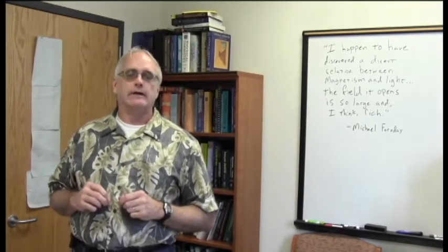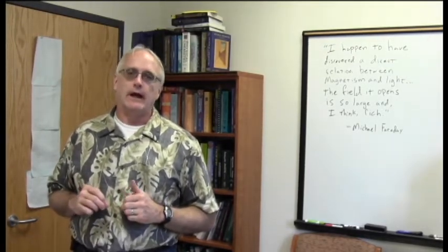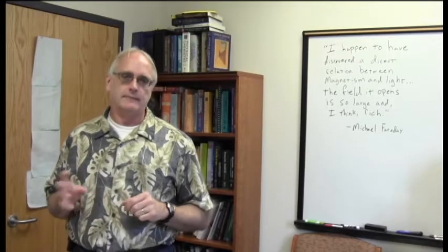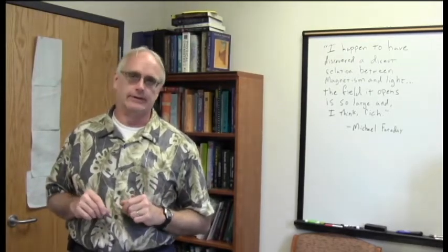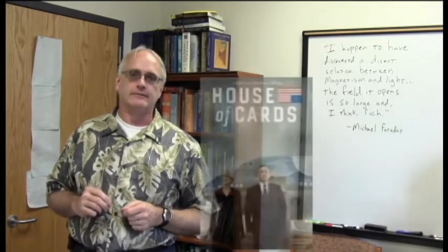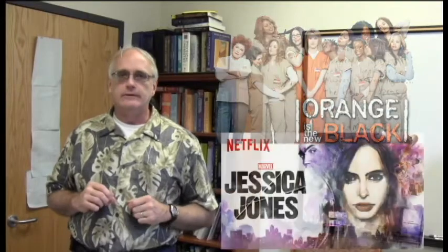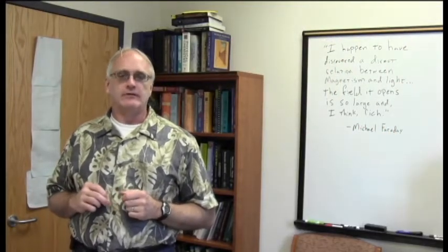Now, Dr. Hurst did not use NMR very often, so he asked me to help him with it. And, naturally, I hemmed and hawed and hesitated and whined and moaned and groaned a little bit about it. But eventually I tore myself away from Netflix long enough to actually help him make up a sample and get down to the NMR spectrometer.